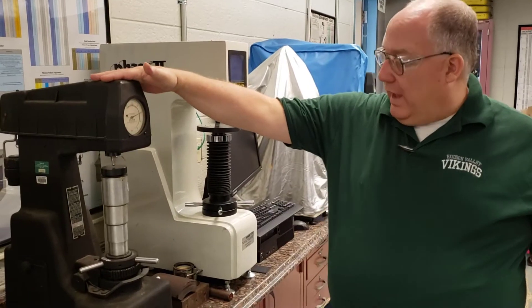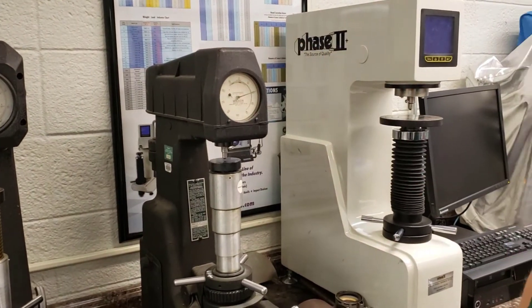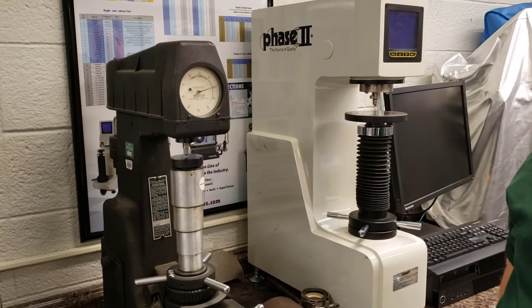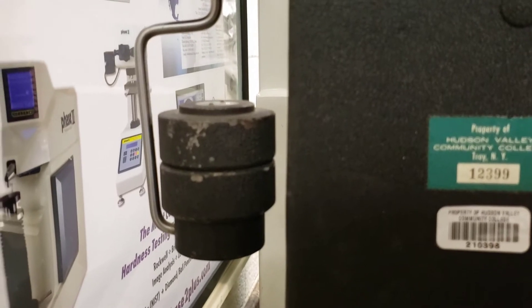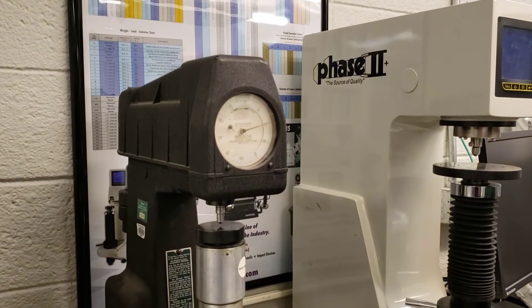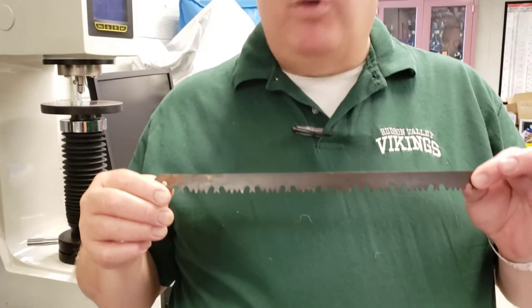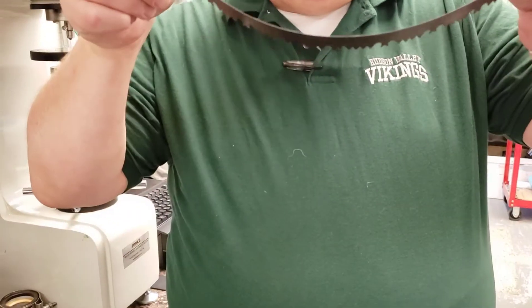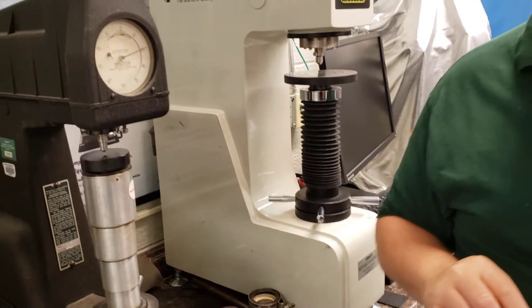This is the Rockwell N tester. It's a bit of a one-trick pony — it only does the N test. You use an N Brale as set in here. It has weights on the back just like the old Rockwell general tester. What makes this one different? It's a superficial tester. Superficial tests let you test thin samples. Take this saw blade — you don't want to test it on a Brinell tester because it will bend and be useless. You use a superficial tester.